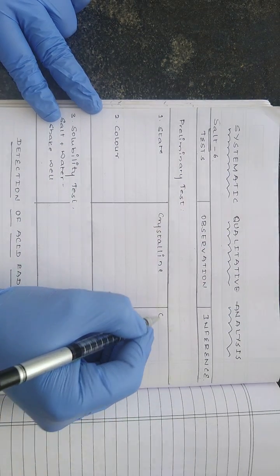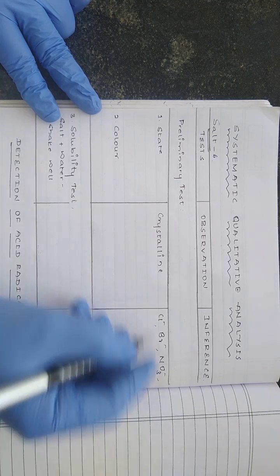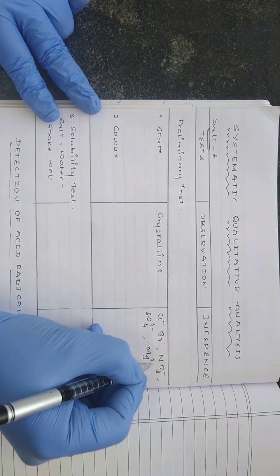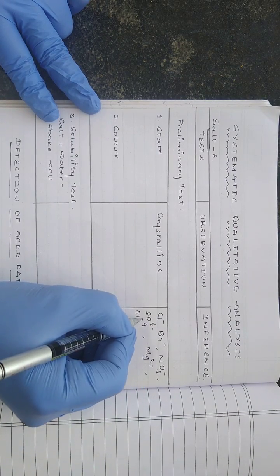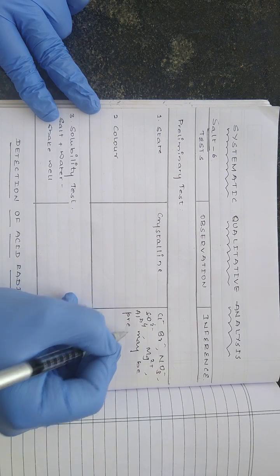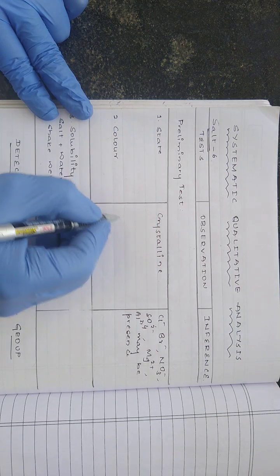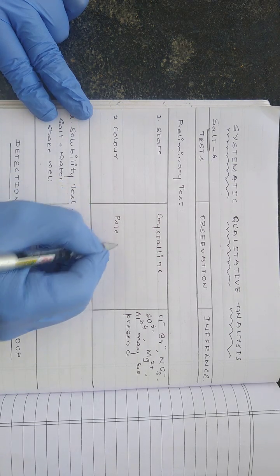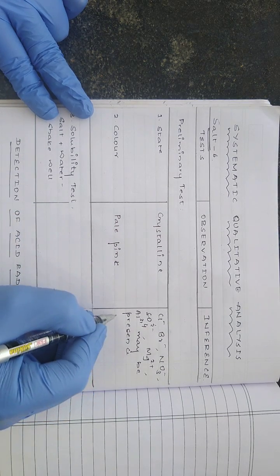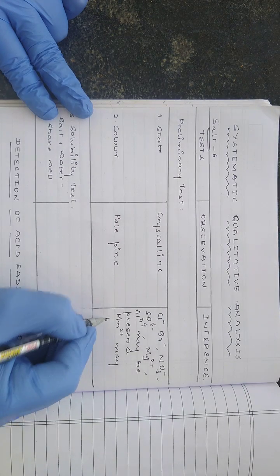So the inference is chloride, bromide, nitrate, sulfate, Mg2+, Al3+ may be present. This is the inference we have got by looking at the state. Second is color. The color of the given salt is pale pink. The pink color is a very light color. So the inference is Mn2+ may be present.